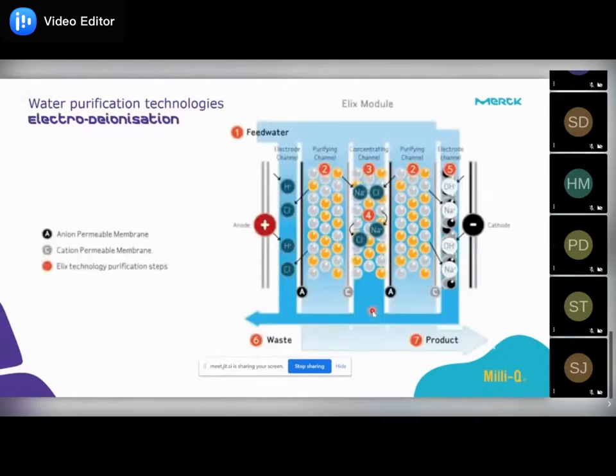Electrodeionization is one of the very unique technologies which has been in the market for ages. All kinds of water purification vendors majorly prefer to use this electrodeionization module. It has a very unique principle, because if you look at ion exchange resins, over a period of time, because of continuous usage, you have to treat and activate these resins by using certain chemicals. Unless you activate them over time, they will not work.